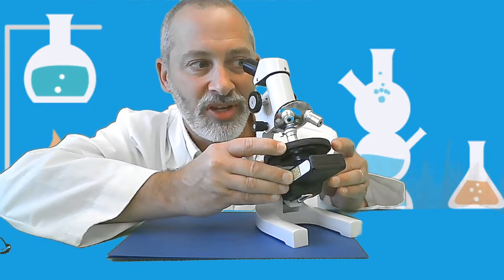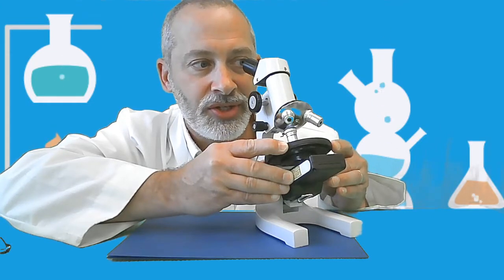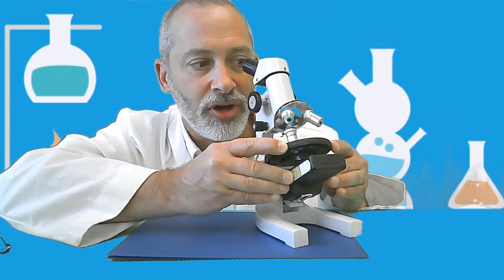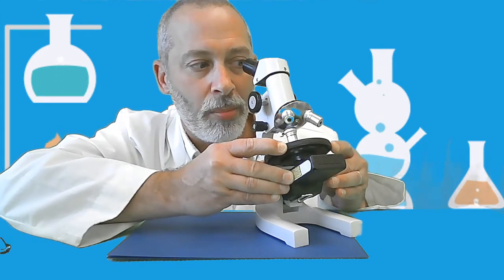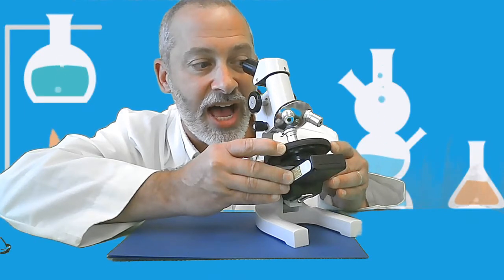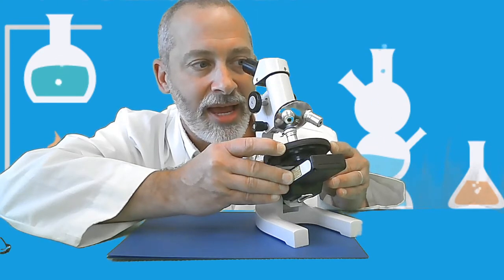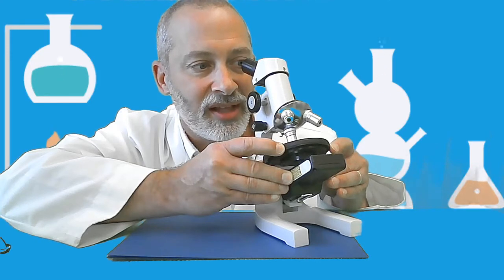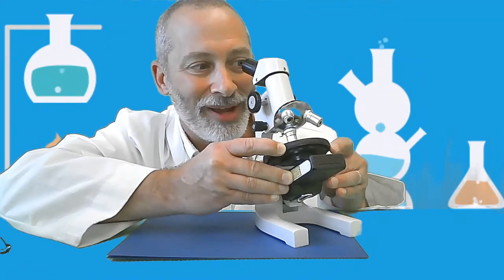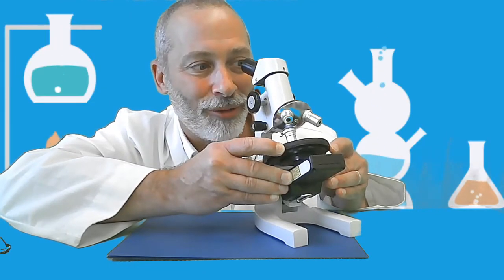Before you settle into any one slide, you really want to hunt around and look for those cells that might represent those things that you are really trying to find. So feel free to hunt around, move the slide around. I think I'm going to settle into this one here. Oh, no, wait, that one next to it is really, oh, wait a minute, there's an even better one. All right, one more. Oh, right there.